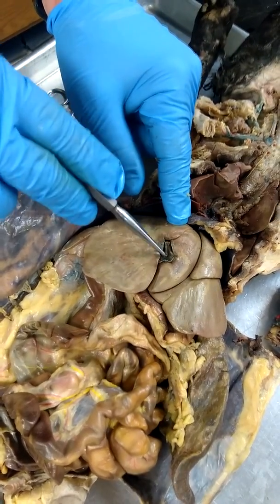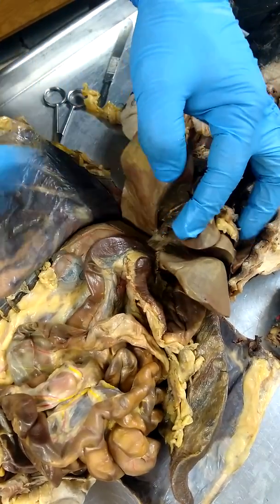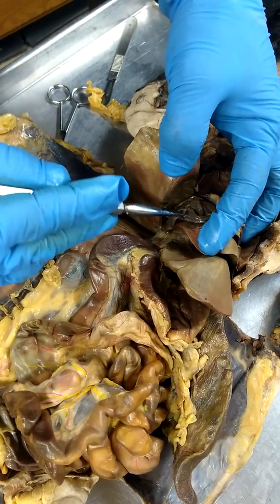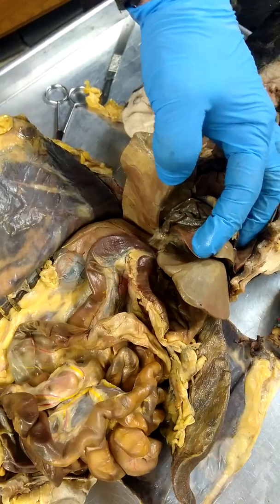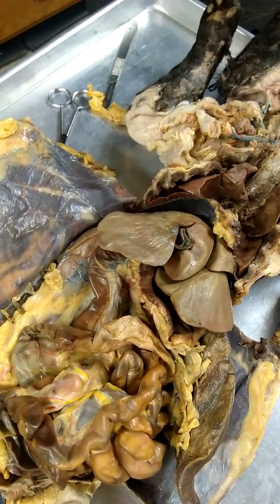In the right medial lobe, you'll see this little crack here. That's where we look for the gallbladder. So that little bag there is a gallbladder. If I open it up, this bag, that's all part of the gallbladder. The little tube that comes off of it is the bile duct. And that's pretty much it.